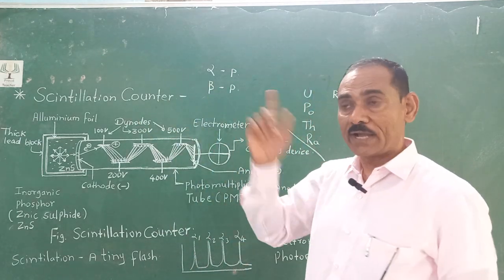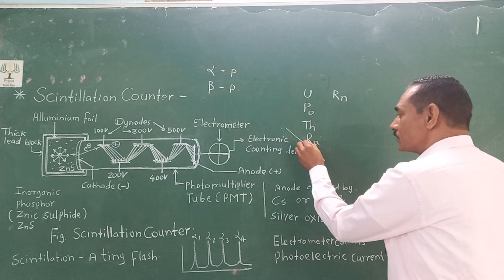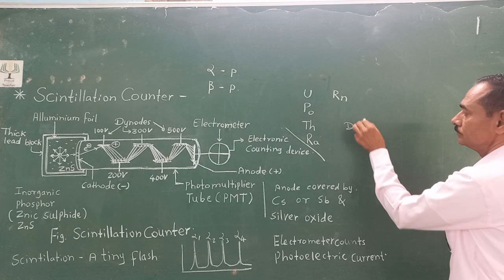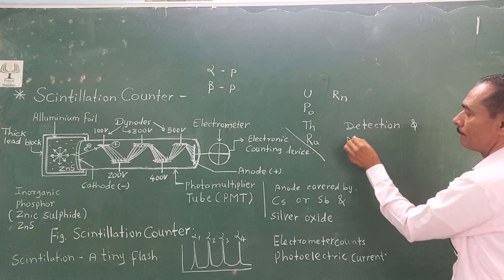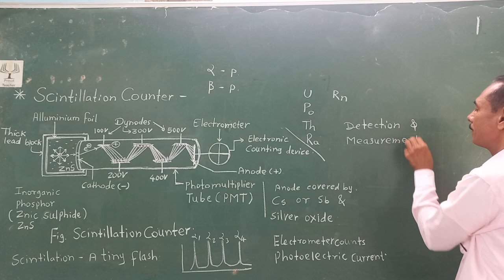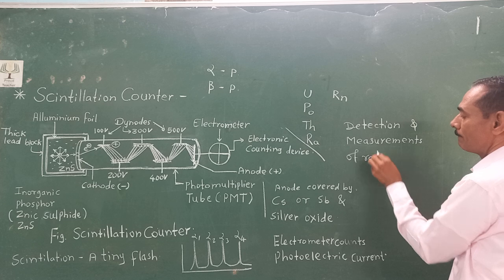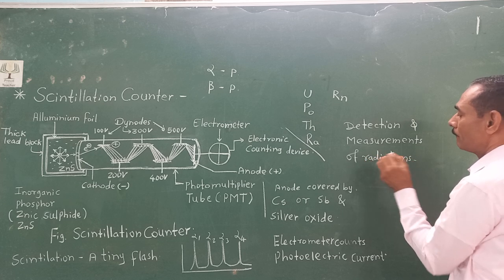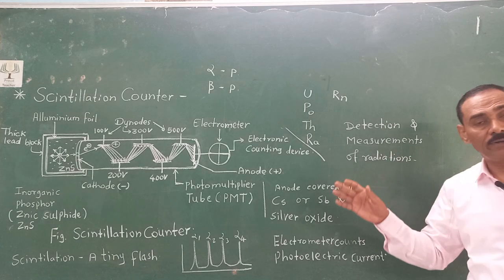And that's why the title for this device is detection and measurement. Detection and measurement of radiations of a radioactive sample source.